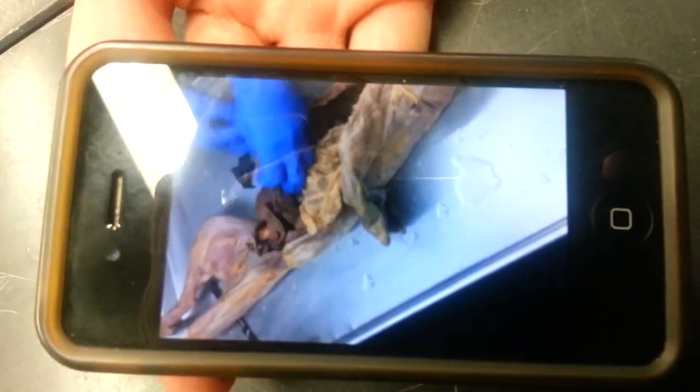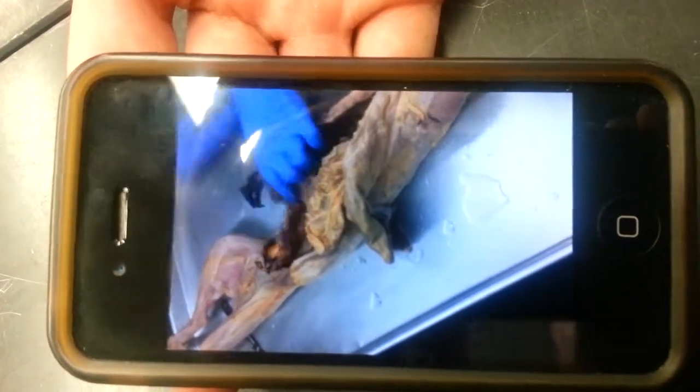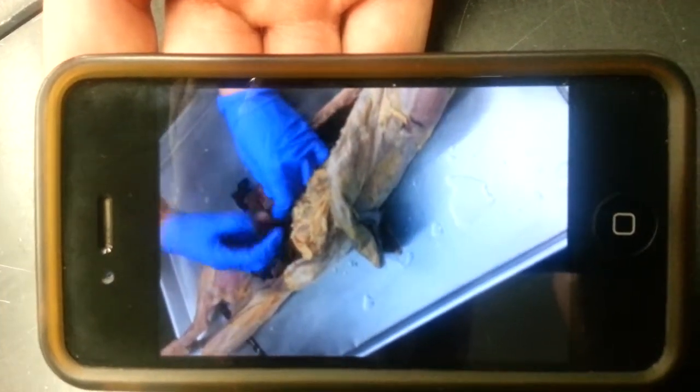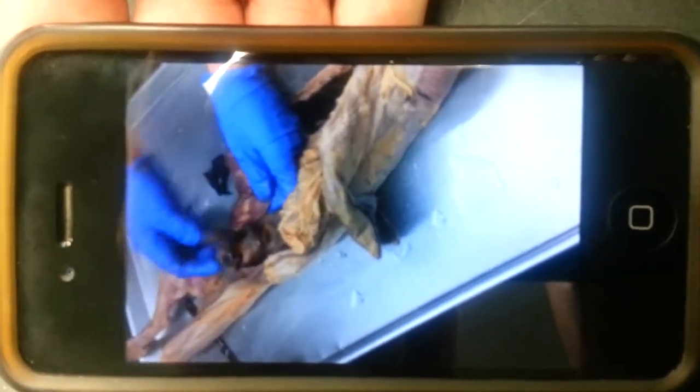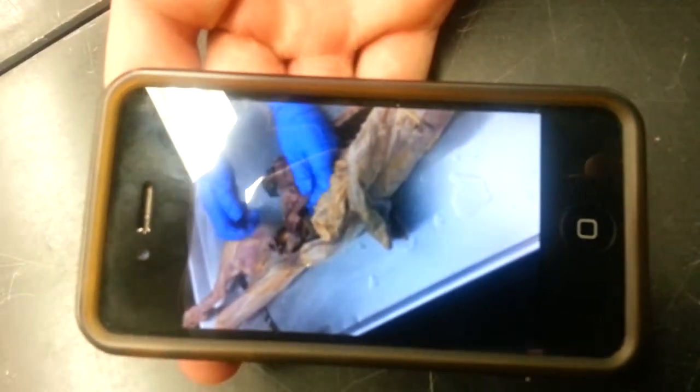So then you've got your intestines here. I don't know, jejunum, ileum, I don't know. I do know that this would be, let me see here. See where these two sections kind of come in like that? It sort of looks like a little lump here and a little lump here. Looks kind of like an M. This is the cecum right here. So this makes this the ileum.